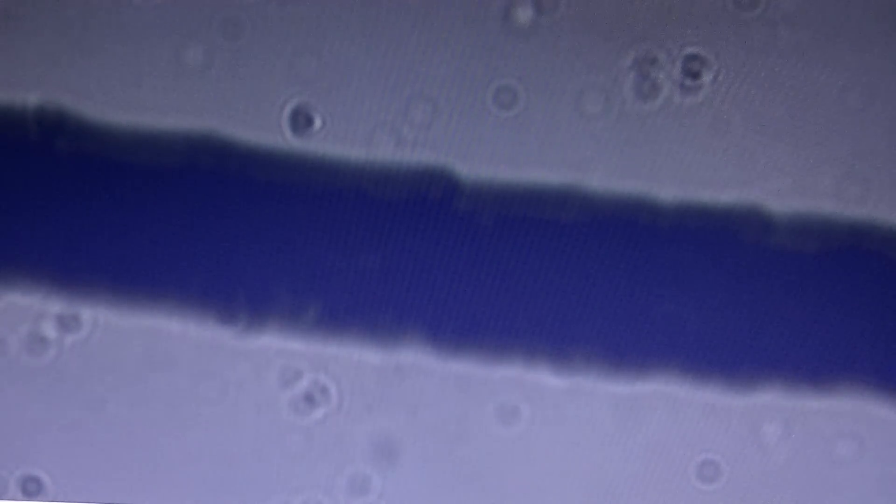Okay, I'm going to do a little bit of microscopic viewing of the chemtrail spiderweb type fibers that appeared in my tree October 25th, 2015. What we're looking at here is a very fine dog hair, and I think this is about 200 power, but with this astronomy telescope on here I really would have to sit down for a while and calculate it.